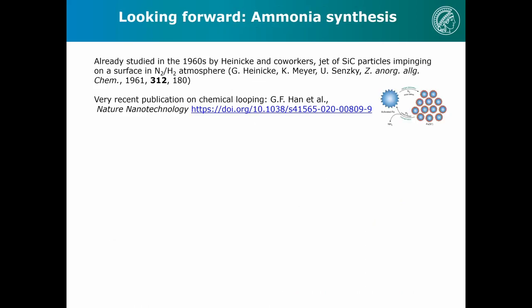The last one was my holy grail when I started with ball milling catalytic reactions. I always said I want to make ammonia synthesis at atmospheric pressure. So we had been working on this for quite a while. It had been studied, with very interesting results already in the 1960s. In East Germany, there was a group in Leipzig who did what at that time they called tribochemistry. So same thing as mechanochemistry, but there were already activities at that time. They reported in a very sketchy publication that they had seen some traces of ammonia. It was not described how they detected it. The setup was not described, so there seems to be some precedent.